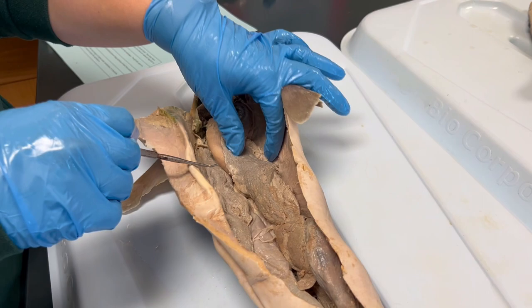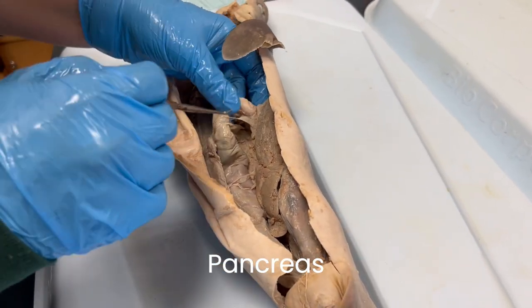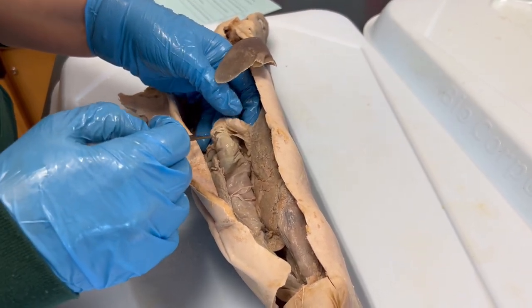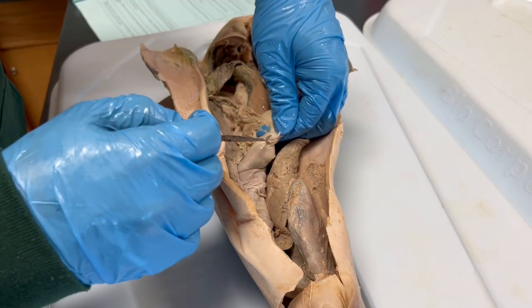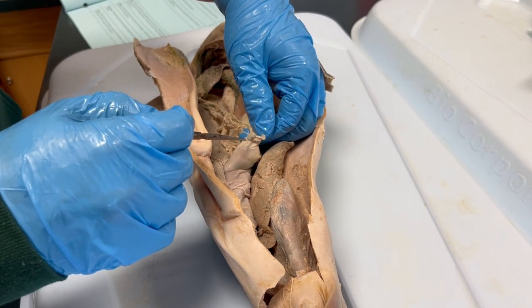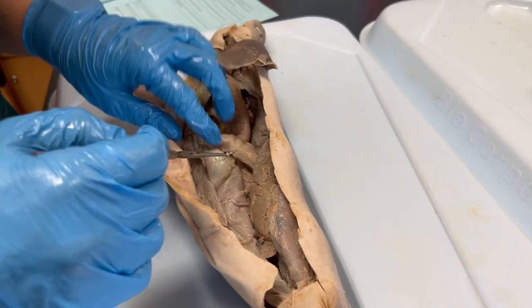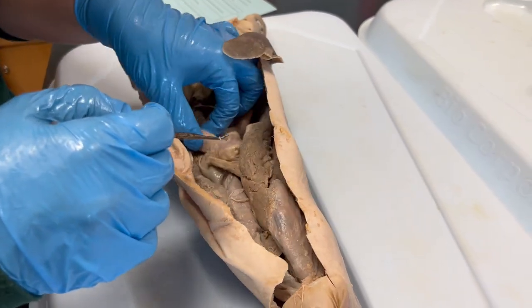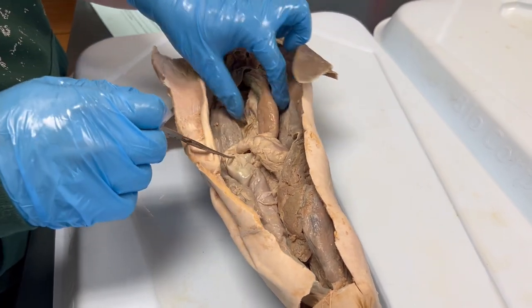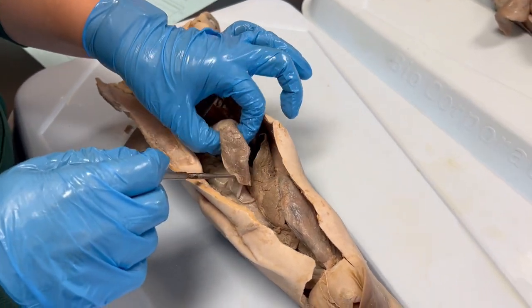The pancreas was a bit difficult to see in many of our dissection specimens this year. It is typically located on the ventral side of the digestive system near the junction of the duodenum and spiral intestine. It is typically a light tan to brown structure and very flattened. The pancreas helps with digestion by producing enzymes needed to break down large chunks of food, and it helps keep their metabolism at a fast pace, which is useful because they swallow their food whole.